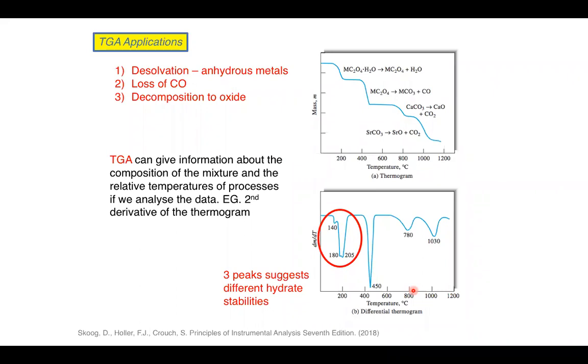Maybe there are more waters than we think. And so some of them are just stuck on the surface. Some of them are actually almost bonded to the metal complex. So TGA can also give quantitative information about water content. The limit of detection is around about 0.5%.